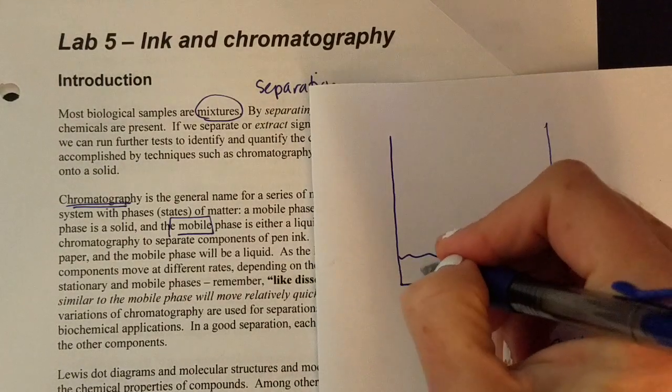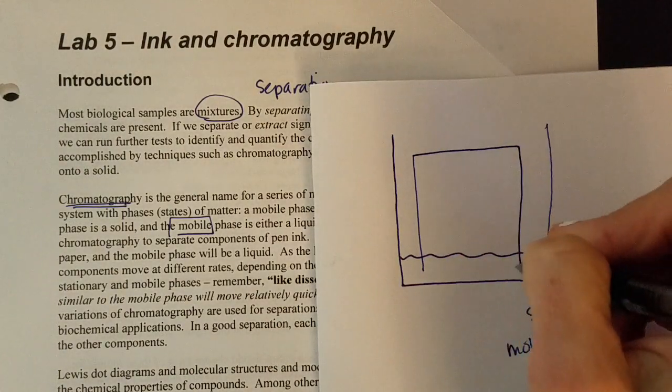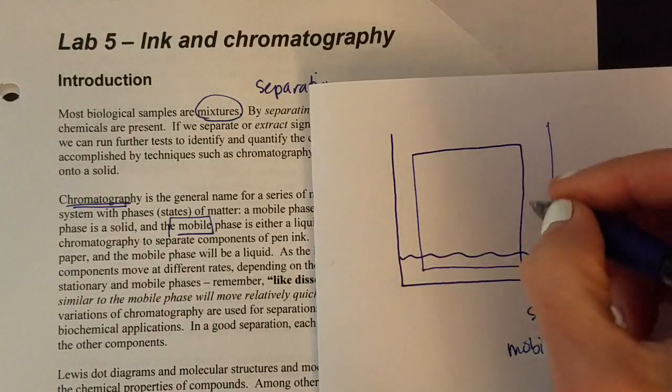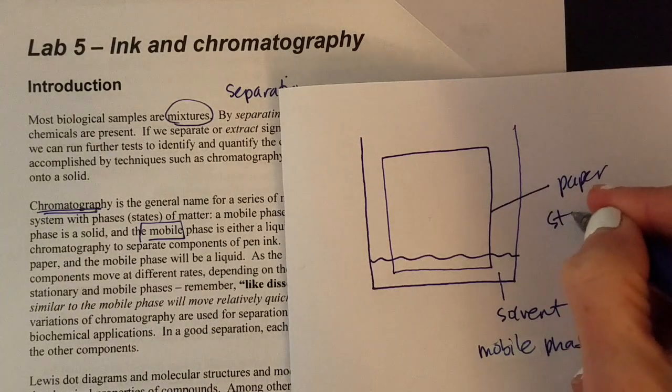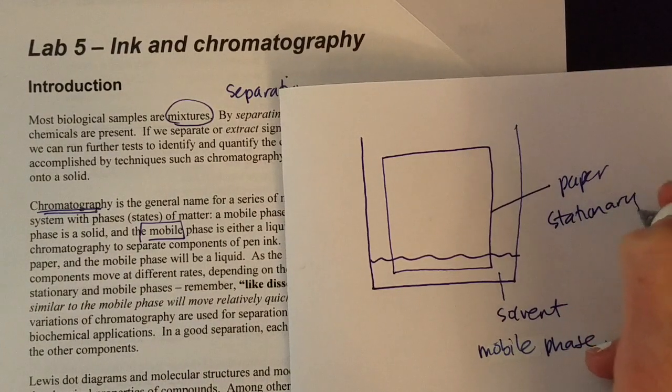So mobile phase will be here and then we'll put into that a piece of paper and that paper is going to be what we call the stationary phase. Stationary as in it doesn't move.